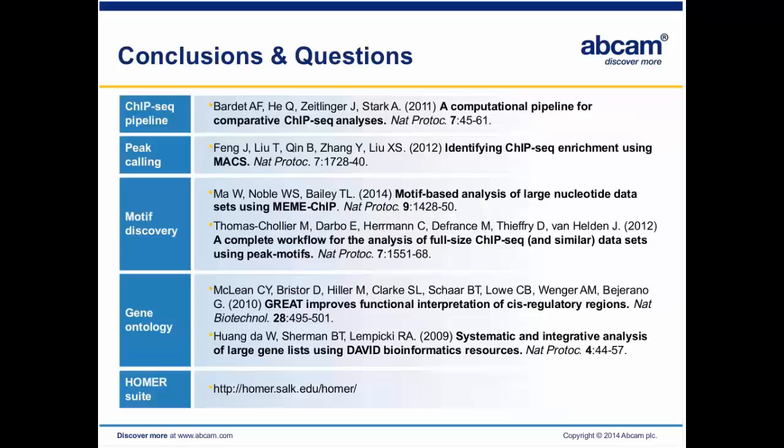So far, that's all the basic ChIP-seq routines done without any programming or command line involved. Hopefully, by running the workflow in the webinar on your own data, you would quickly have a general idea about what ChIP-seq datasets look like and what we expect from a ChIP-seq dataset. Here, I put some references, mainly from Nature Protocols, containing detailed step-by-step guidance, including troubleshooting tips, on key aspects of ChIP-seq analysis. Some of them require some programming or at least command line experience.